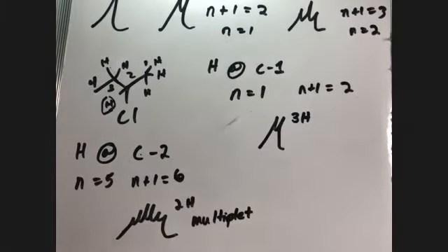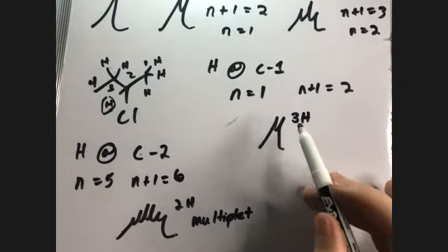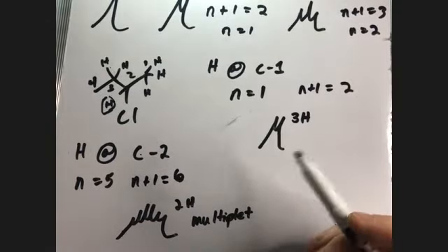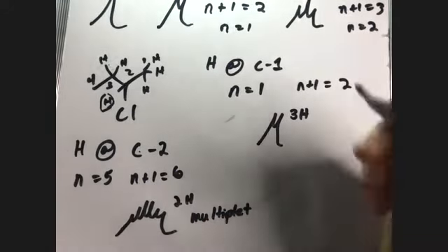And that's not very useful for figuring out the number of neighbors. So what you do in that case, if it's defined as a multiplet, is you have to look at the other signals that are more clear, like this doublet, and there's no ambiguity there. That has just one proton neighbor, and therefore it's a clear peak, whereas the multiplets may be unclear, but you can use the clear ones to piece your molecule together.